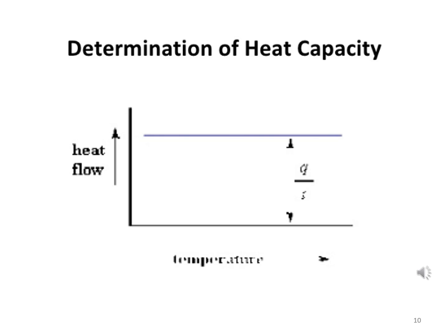If we are going to determine heat capacity by a DSC analyzer, the DSC plot can be used for this. For example, suppose you have a polymer that is being heated in a DSC analyzer. There is a sample pan in which you have added the polymer, and a reference pan.